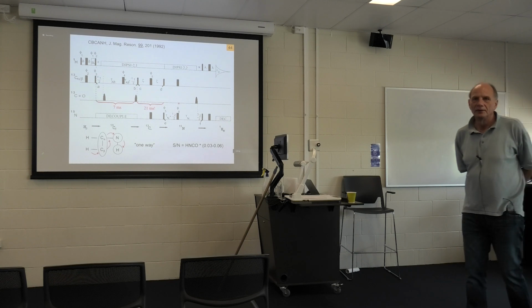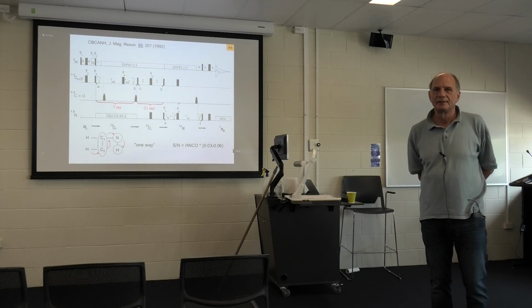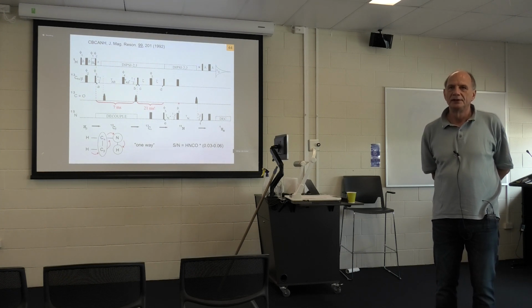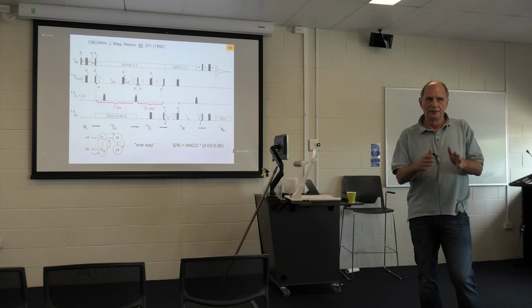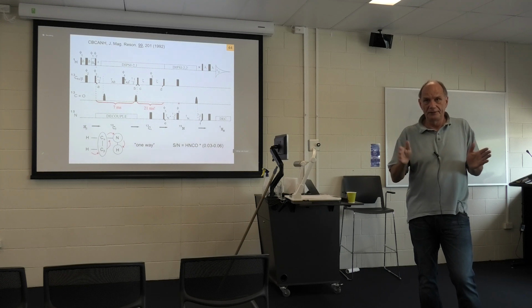Yes. Can you explain again why in the carbon-13 HSQC the peak intensities vary a lot, whereas in the 15N HSQC they don't? First of all, the C-alpha relaxation is more efficient, so we are more affected by this. And then you're not recording the whole evolution, so you're apodizing.